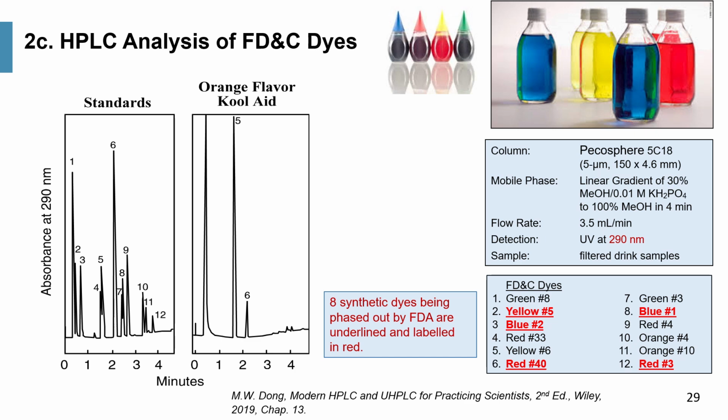The HPLC analysis of food dyes is kind of in the news these days, from the recent banning of a number of synthetic dyes as being phased out, and some of them being phased out are shown here. These are underlined and labeled in red.